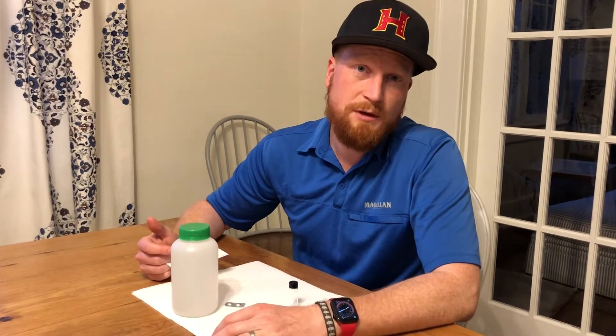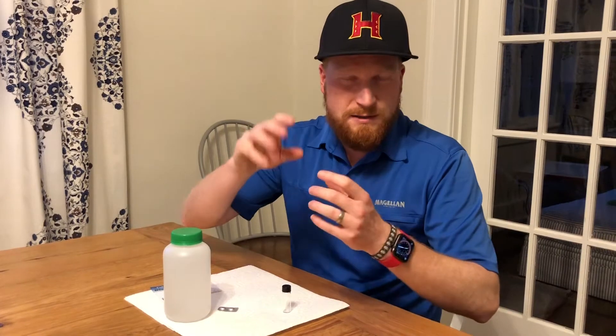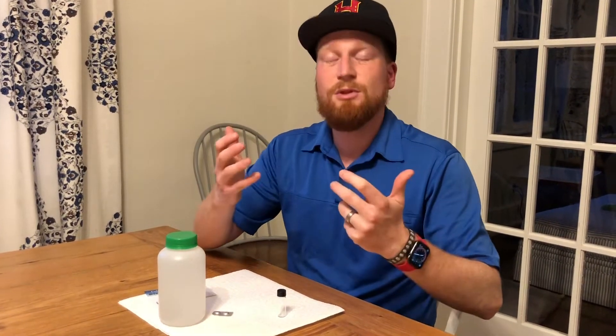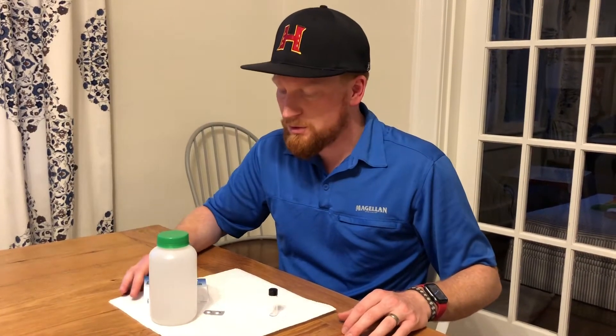So we test for dissolved oxygen to see how much oxygen is inside the water. It's kind of like a coke where it has the carbonation inside of it, except the oxygen bubbles are a lot smaller, and that's what the fish actually take in through their gills. So by seeing how much dissolved oxygen is in the water, we see how much oxygen is available for fish.